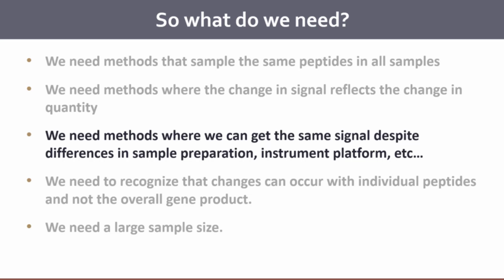So there are predictions. Most of the prediction algorithms were derived from DDA data, because those machine learning algorithms were trained on whether or not a peptide is detected by a DDA algorithm, so that means whether it was triggered on something, and whether or not that was then matched with a search algorithm. Those tools are very good at predicting whether or not you're going to sample a peptide and determine it from a search engine. So Brian has a tool that he calls Prego.